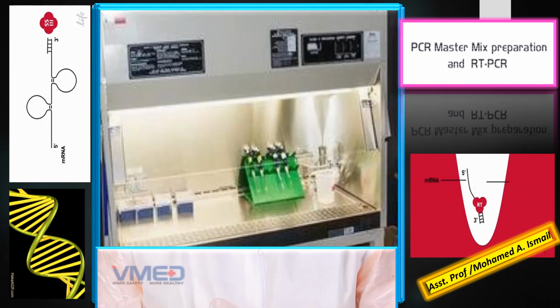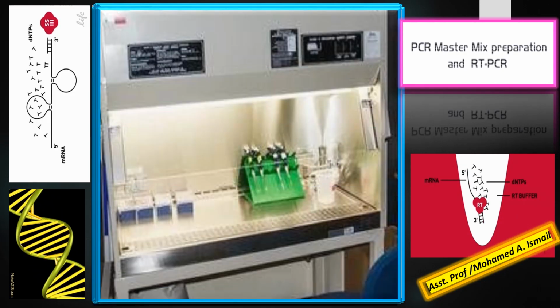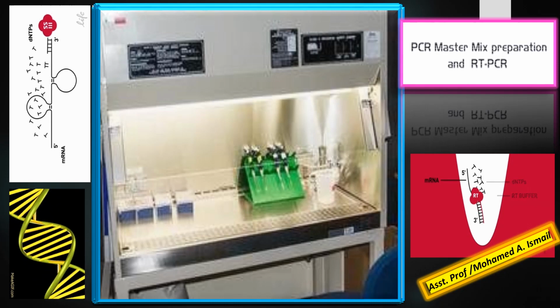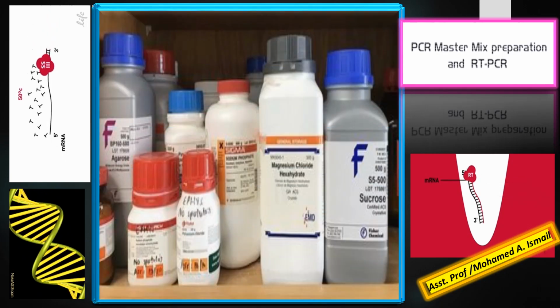All stock solutions of reagents are stored at -20 Celsius.